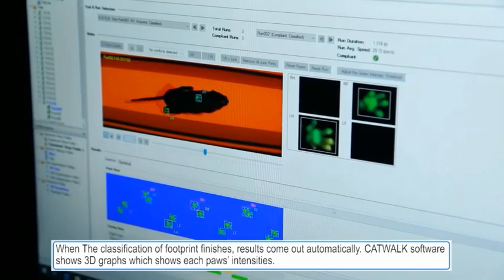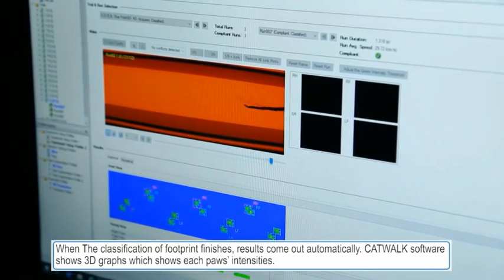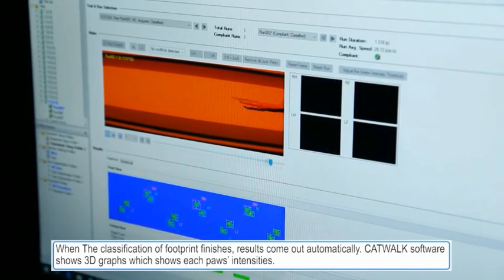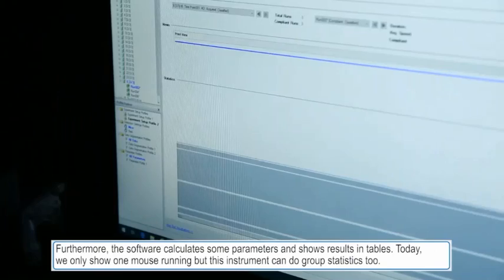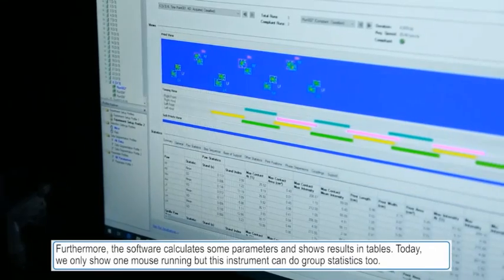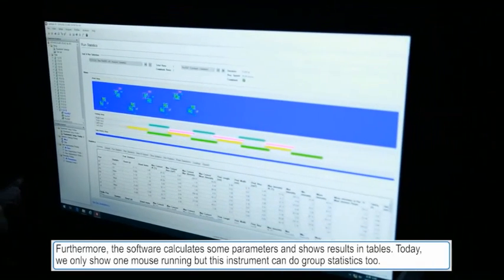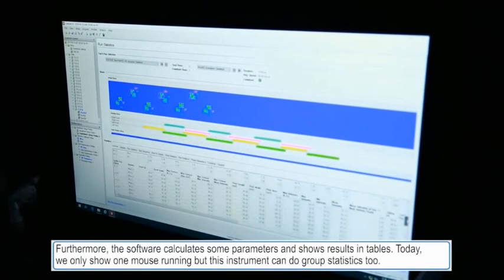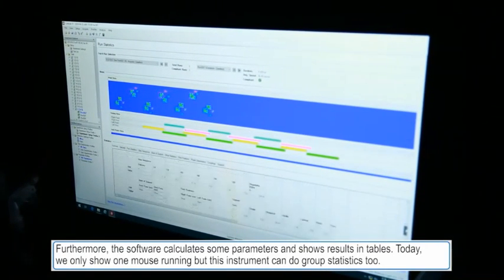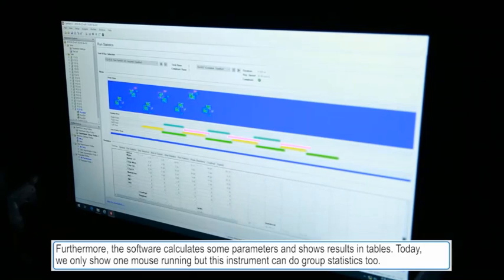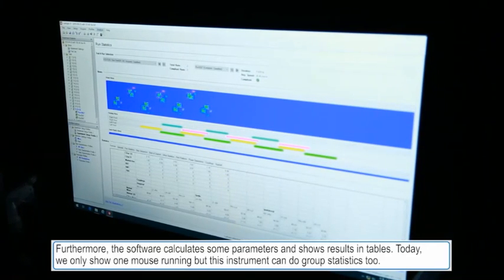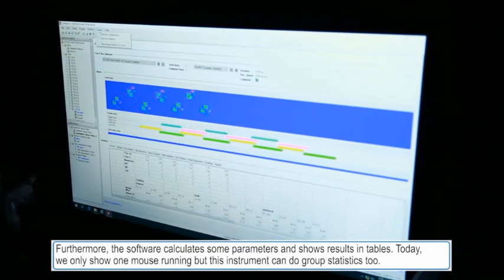CatWalk software shows 3D graphs displaying each paw's intensities. Furthermore, the software calculates parameters and shows results in a table. Today we only showed one mouse running, but this instrument can perform group statistics too.